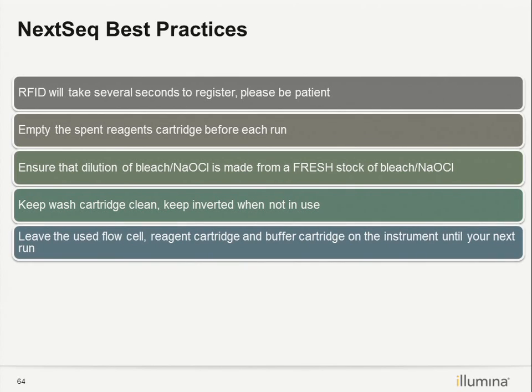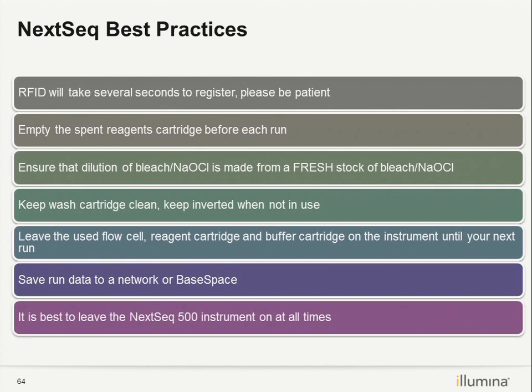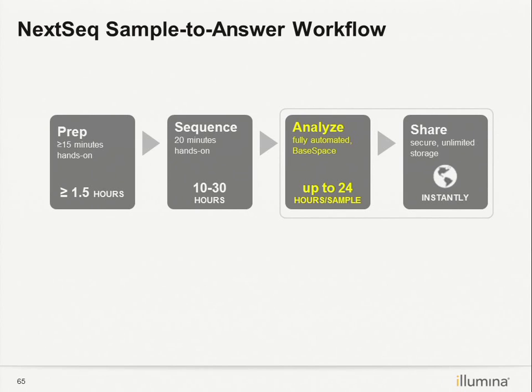Invert them to let them dry to avoid the growth of mold, and leave the flow cells on the instrument until the next run. Okay, and save data in the network drive, and you can keep it on at all times.